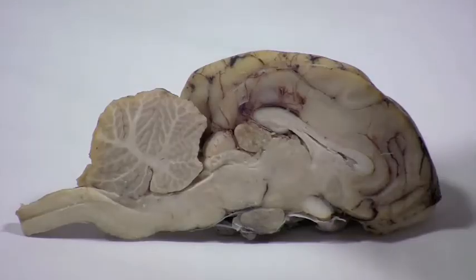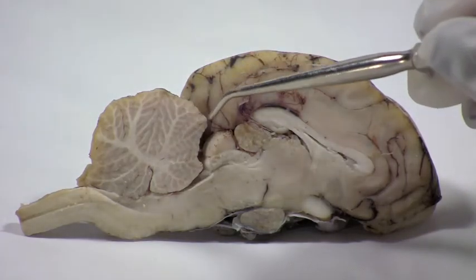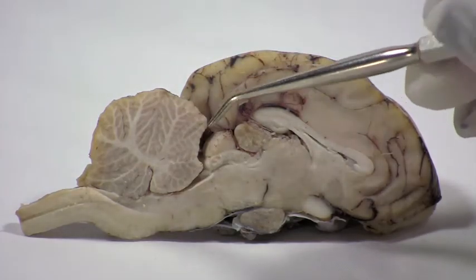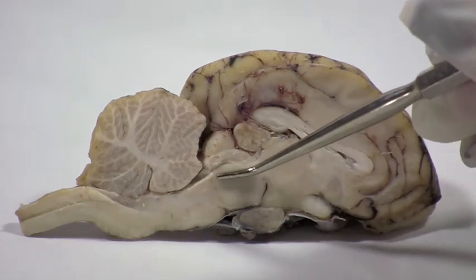Lastly, let's take a look at the brainstem in a mid-sagittal section. Here is the transverse fissure, and just anterior to the transverse fissure is the superior portion of the brainstem, a region called the midbrain.